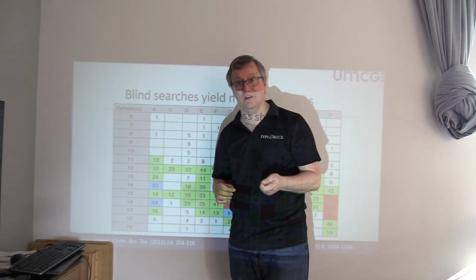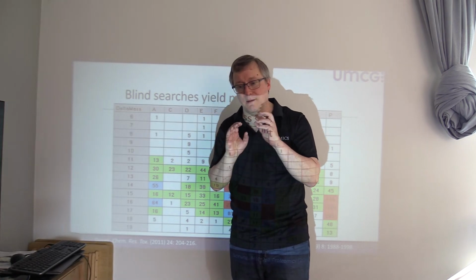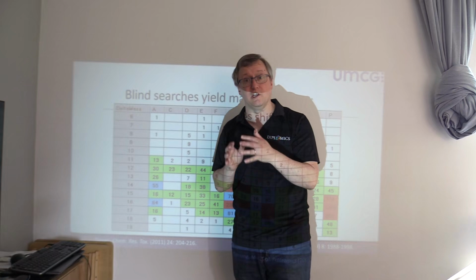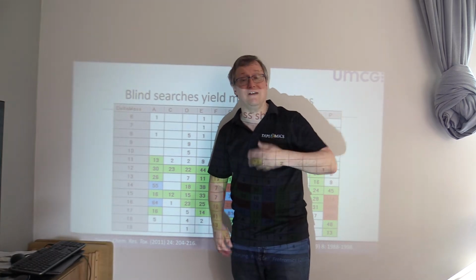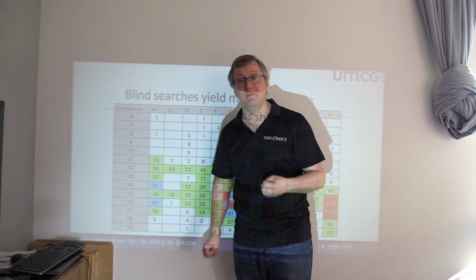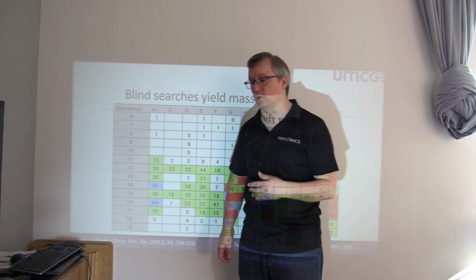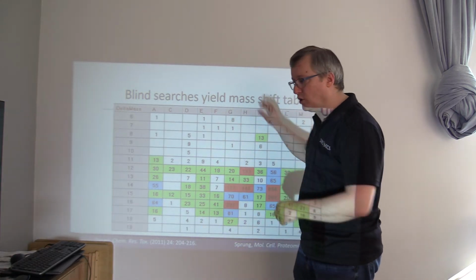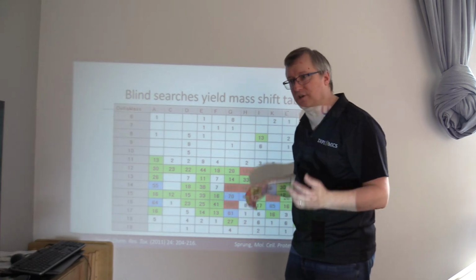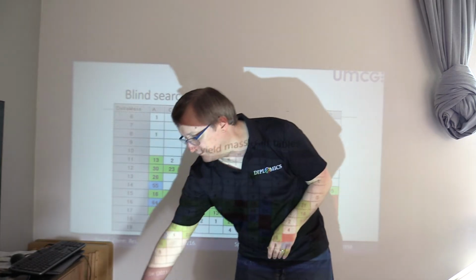Remember that collagen, that protein I was talking about quite recently, is a major component of extracellular matrix. Samples from formalin-fixed and paraffin-embedded tissue have a lot of ECM within them. Therefore, they're going to have a lot of collagen and a lot of hydroxyproline. But these tables are a way to reason out, to summarize all the different mass shifts, understanding which amino acids are most likely to bear them.